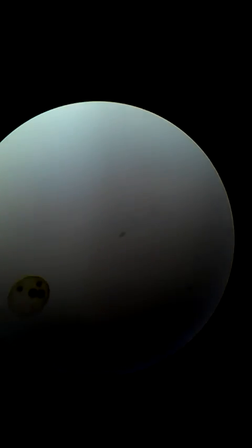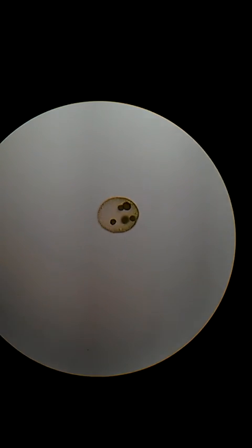Let's see if that's any better. One thing I've noticed is that trying again sometimes helps. Sometimes what happens is the oil dries out on it a little bit — and then I could not see anything.